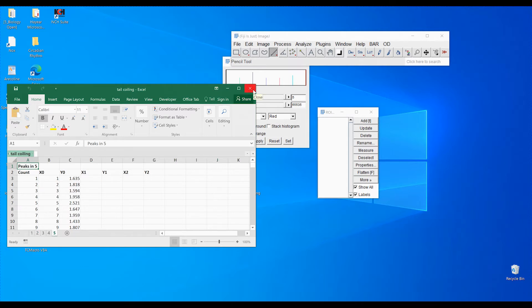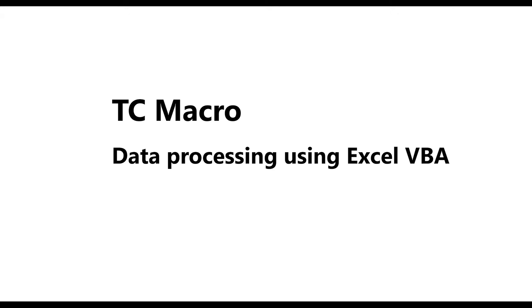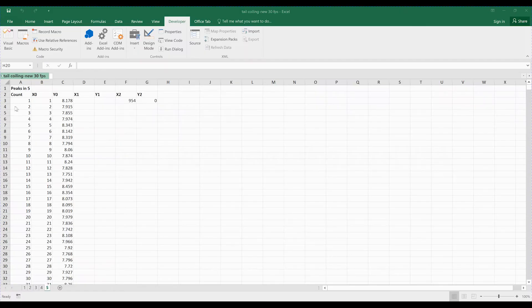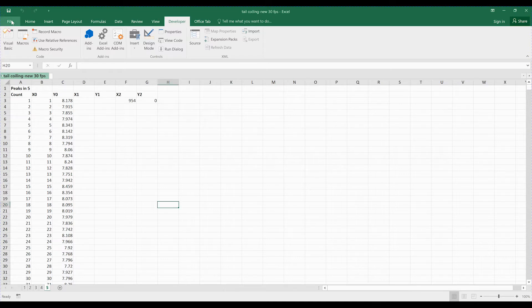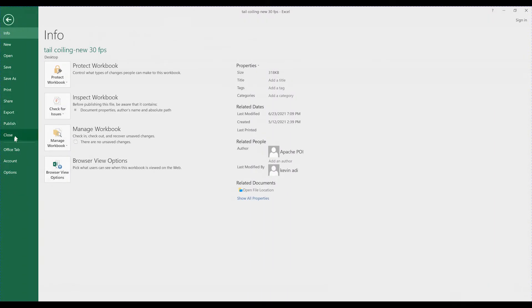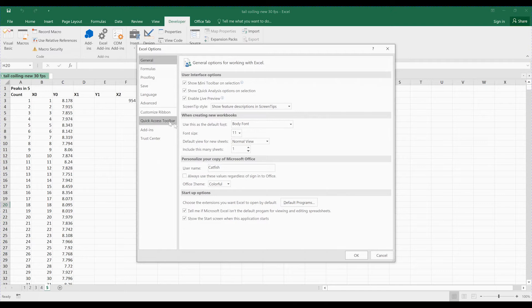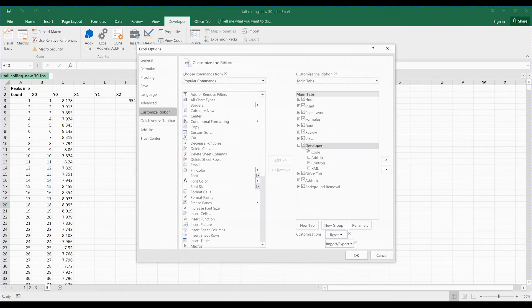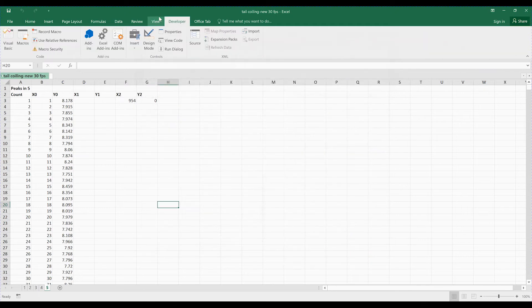That's it for the ImageJ explanation. This is the Excel VBA part for the TC macro. I will tell you how to enable the VBA until you get all the results. First, enable VBA by clicking File > Options > Customize Ribbon and tick the Developer box. After you tick the box, click OK and you will have a new tab called Developer.